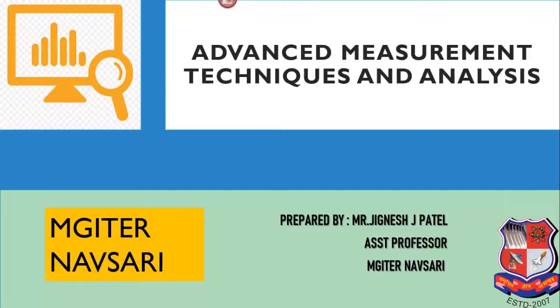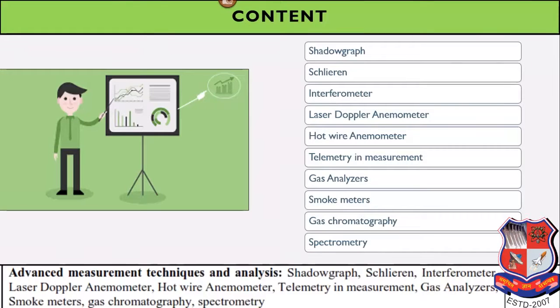Now, in this chapter, we are going to talk about gas chromatography, how we can take one fluid in which some volatile particles will be there. So how much volatile particle will be there in the whole fluid? The percentage of this volatile particle we have to measure by means of gas chromatography.